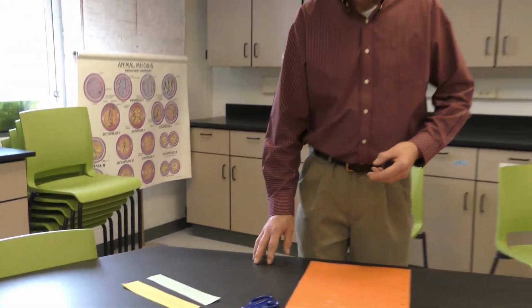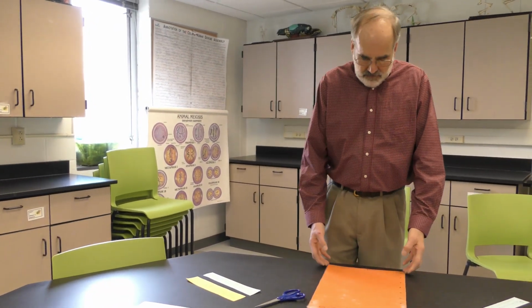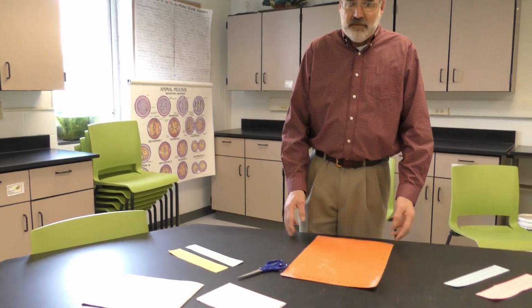Retroviruses are viruses that can randomly insert DNA into our genome. It's estimated that 8 to 10% of our DNA right now is represented by the insertion of random pieces of viral DNA. That said, let's analyze these DNA fragments using hypothetical gel electrophoresis.